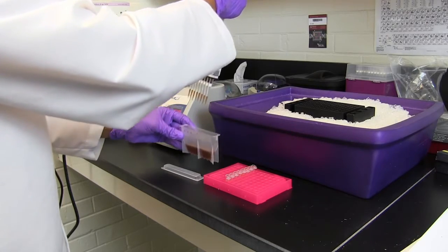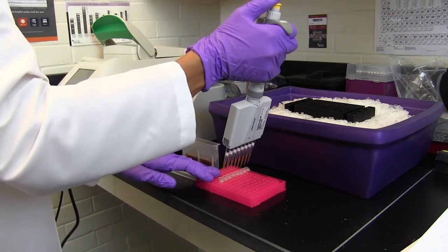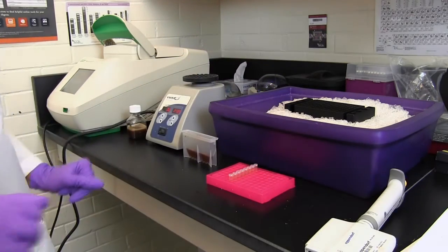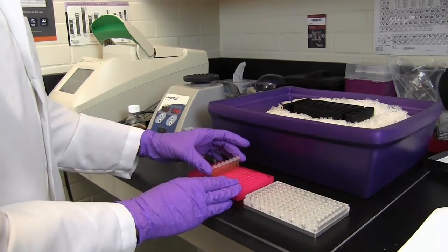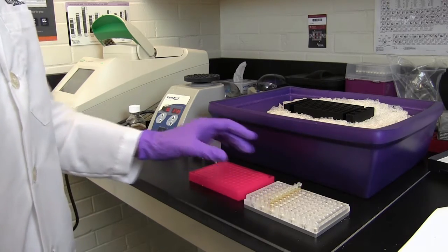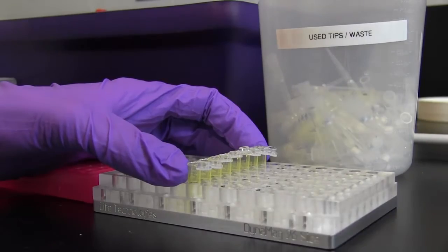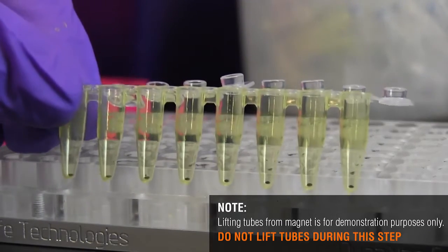For the second round of size selection, add new magnetic beads. Incubate for 5 minutes. Expose to a magnetic field and remove the supernatant. Discard the supernatant as the desired DNA is bound to the beads in the pellet.